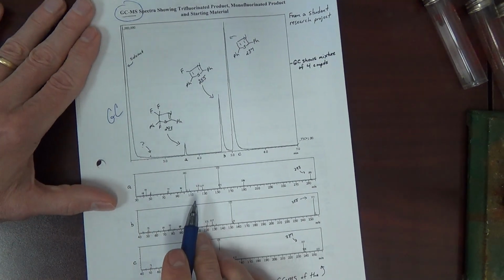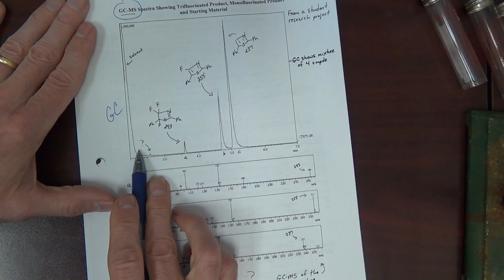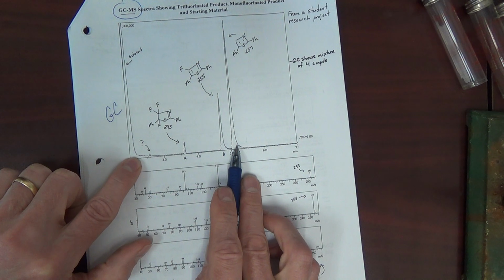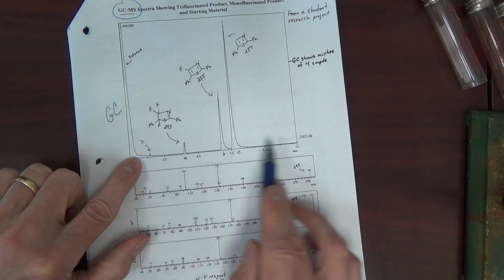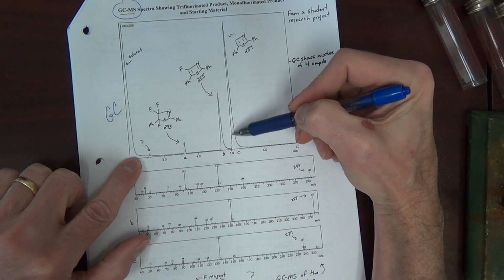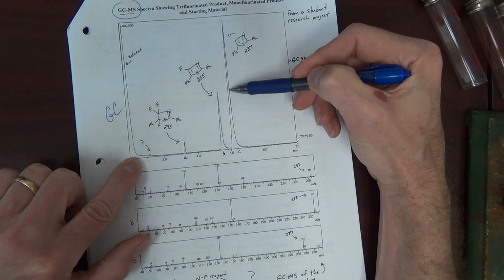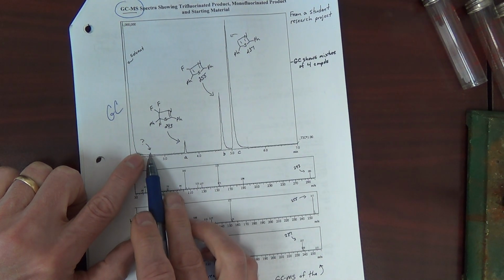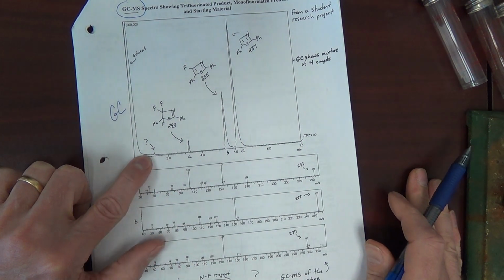The GC, just like TLC, gives a peak for each component. Now this is actually solvent. But we end up with 1, 2, 3, 4 peaks in the GC. This would be analogous to having 4 spots on your TLC. Now, with the GC, you're going to be able to quantify your components much better. Ultimately, this peak, the area under the curve, is much larger than the other 3. This is your major component, then this one, and so on. Your first one was a more minor component, but it's still present. And each of these had a different retention time on the GC column.